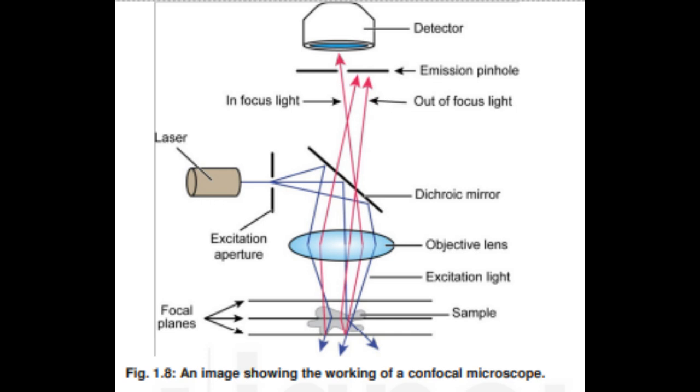This microscope uses fluorescence optics. Fluorophores, i.e., fluorescent chemical compounds that can re-emit light upon excitation, are used in the sample. Fluorophores contain aromatic groups, planar or cyclic molecules with several pi bonds. When the laser light gets focused on a defined spot at a specific depth within the sample, fluorescent light gets emitted exactly at that point.